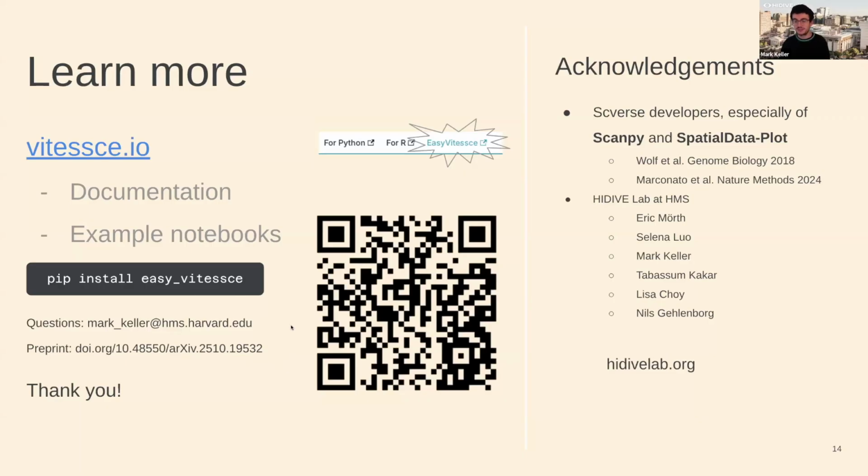So thank you. Thank you very much, Mark. And this is hopefully a tool that many in the community will find useful, because it's really a very low friction way of getting interactive visualization, where so far you might have been dealing with static plots that are, as Mark nicely demonstrated, quite limited in terms of what you can do when you're trying to explore a data set.